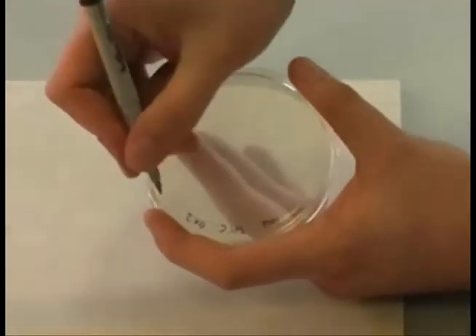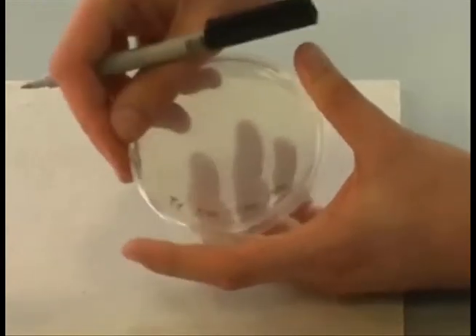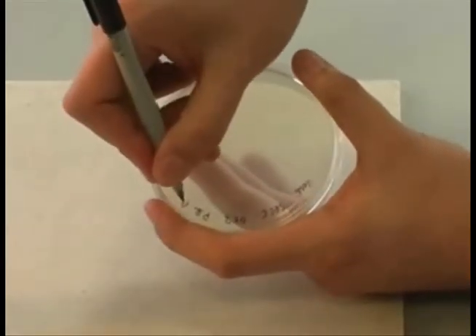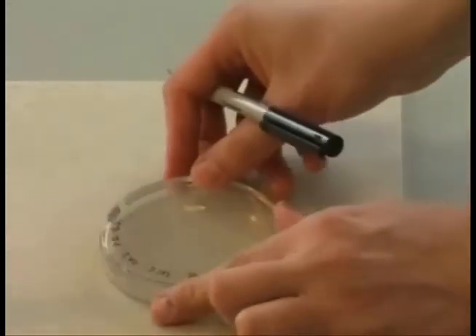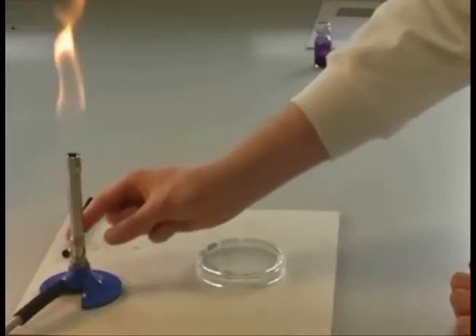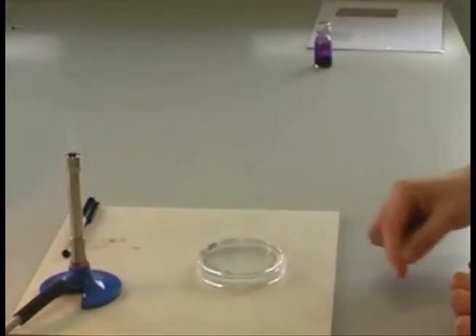Plates should be labelled with your name, the date, your class set, and the name of the organism to qualify as being fully labelled. Before starting to work, always turn the Bunsen flame to blue to ensure you are working in a sterile field.